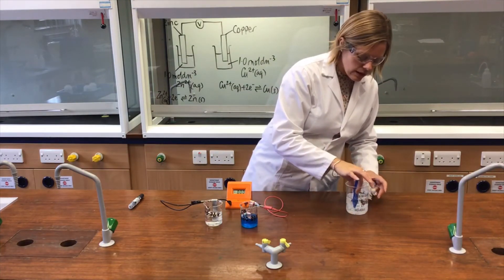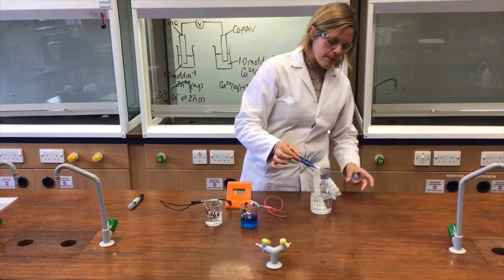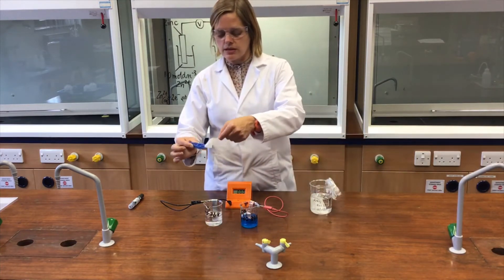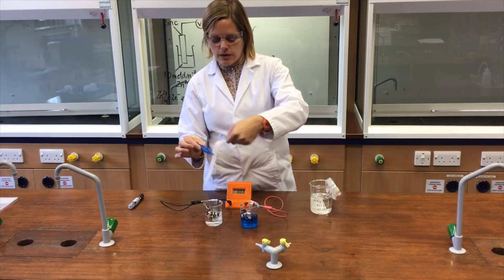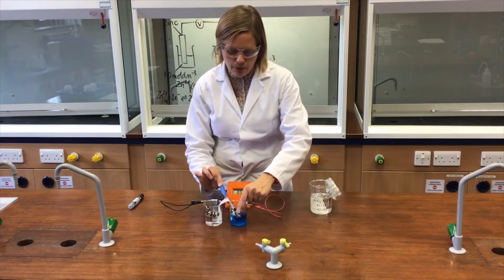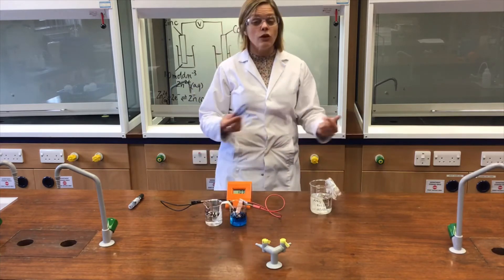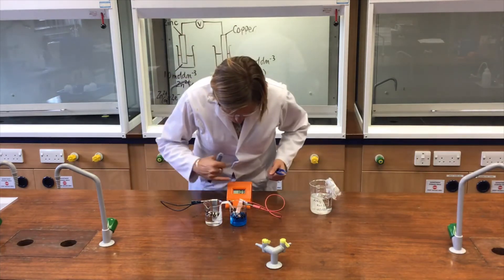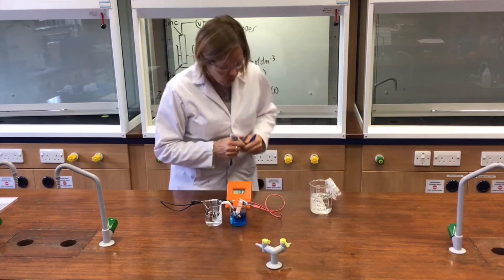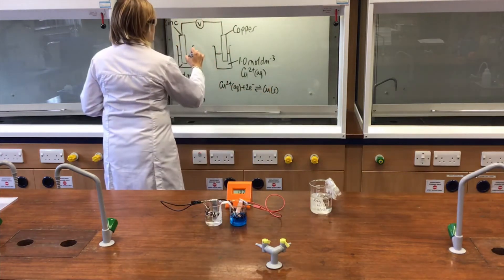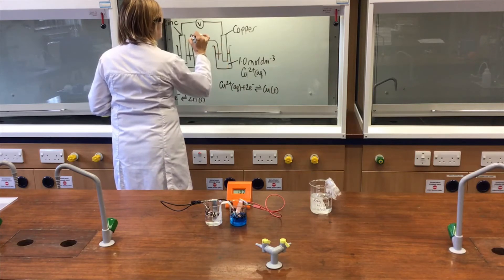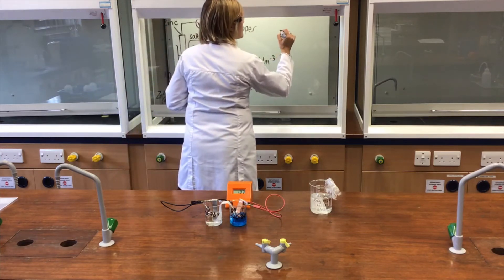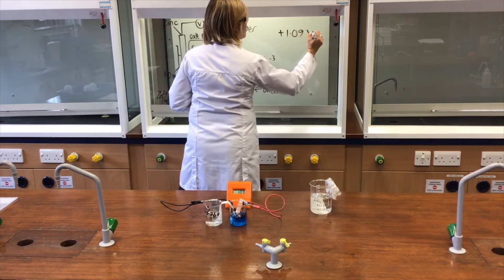A salt bridge is fairly straightforward — it's just a piece of filter paper that has been soaking in potassium nitrate solution overnight. I dip one end into one beaker and the other end into the other beaker. It allows ions to travel through it but not electrons, forcing electrons through the external circuit. The voltmeter now reads 1.09 volts — by adding the salt bridge to complete the circuit, I've measured a potential difference of plus 1.09 volts.